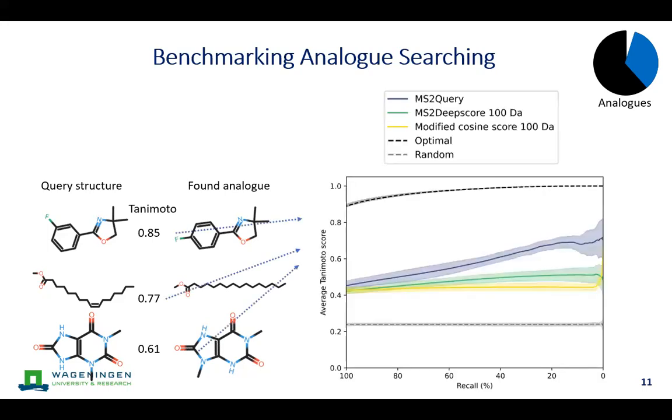1 is equal. That means that if we do a random sort in this GNPS library, we get roughly 0.2. If we look for the optimal analog, it is 0.9-ish, and then getting closer to 1 if we increase the threshold. In other words, the further right here we increase the threshold, so we get more and more reliable matches, and you can see that coming back in the scores.